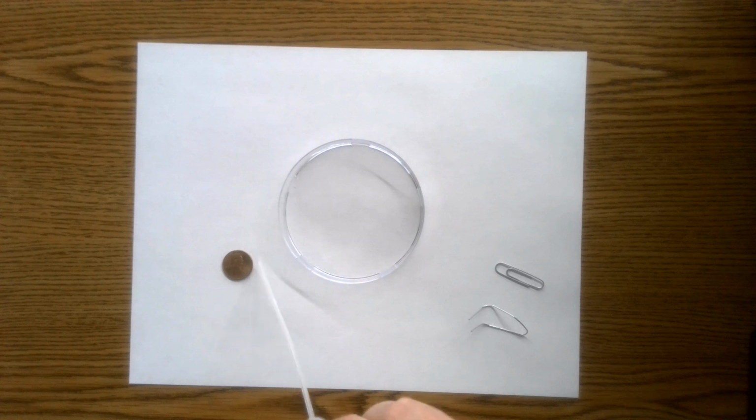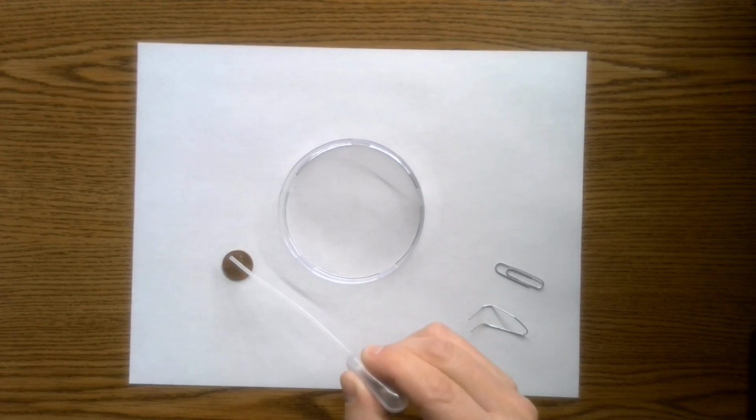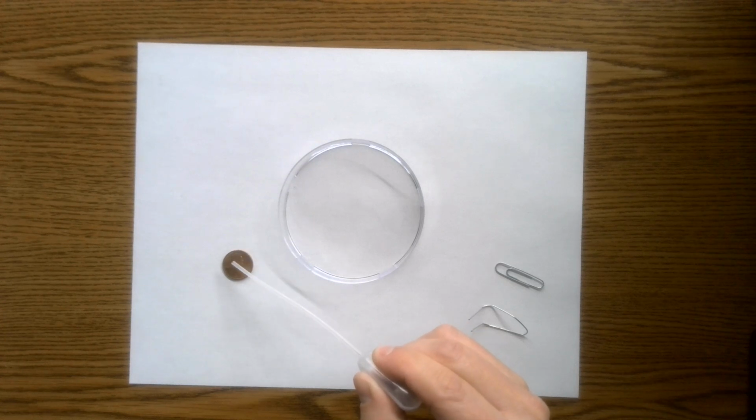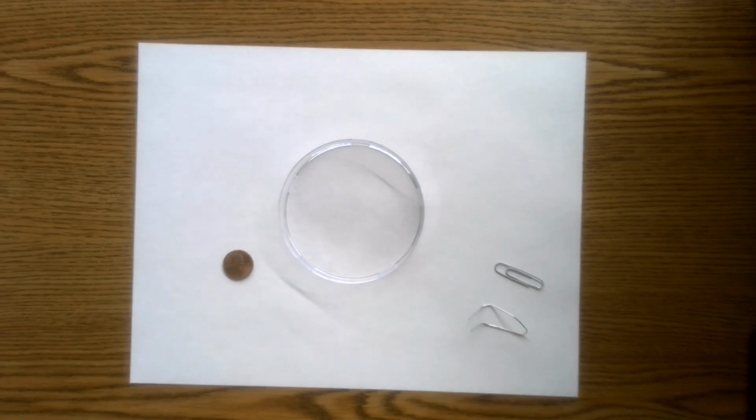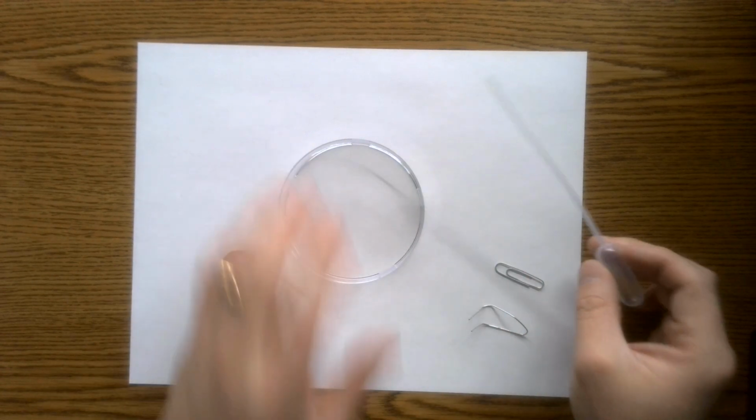And these are cohesive forces that are sticking together, that are making this bubble. And once you get too many, those hydrogen bonds will break, and then the water will spill over the edge. So I want to see how many drops can you put on a penny. Okay, so that's the second one.